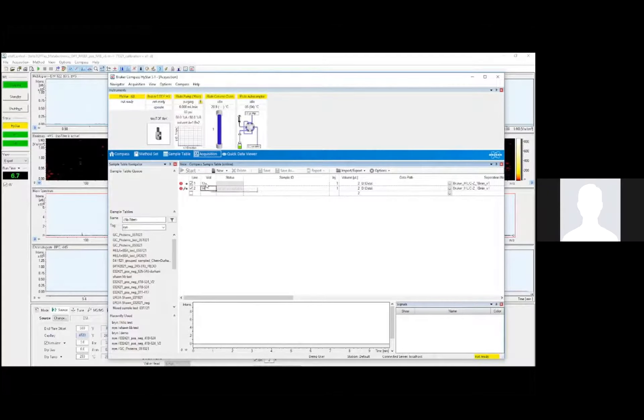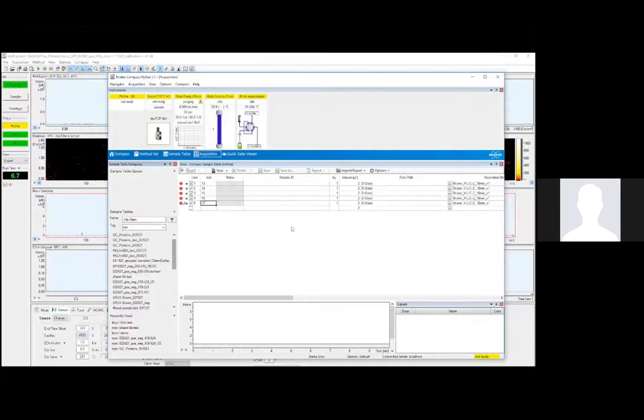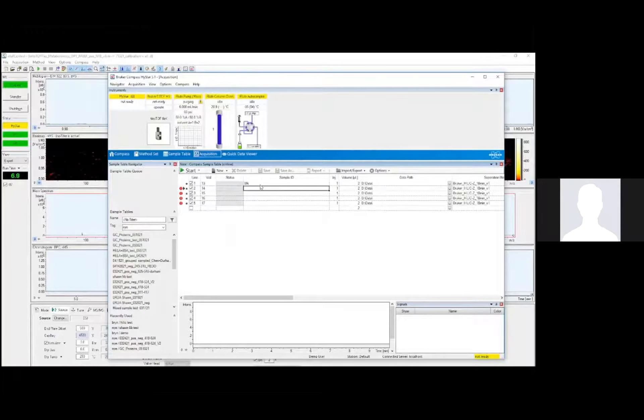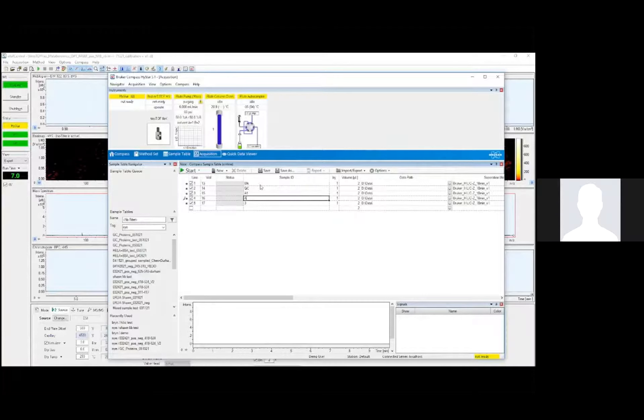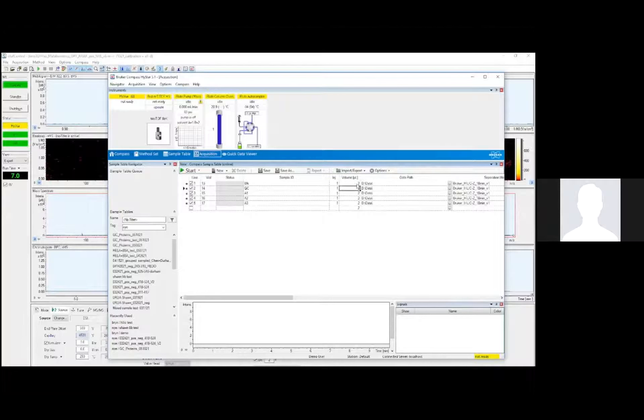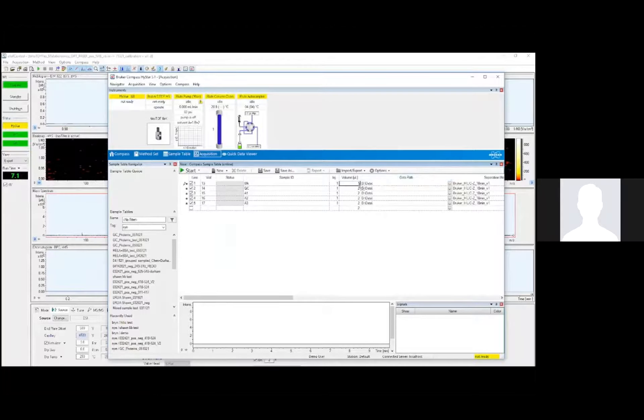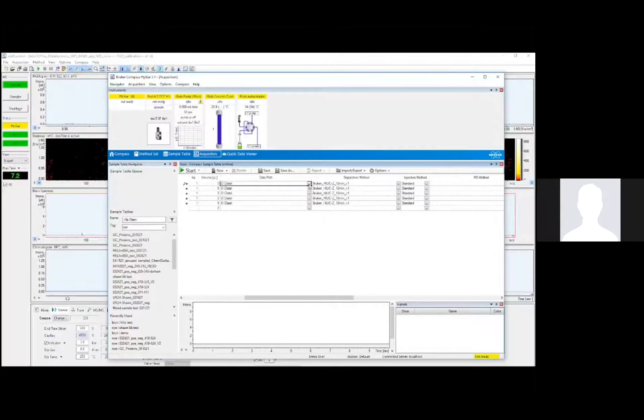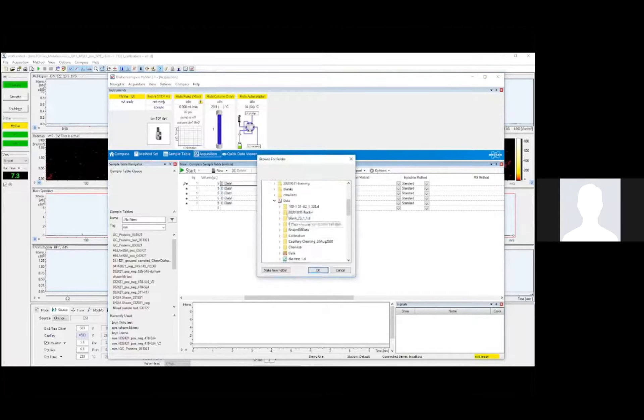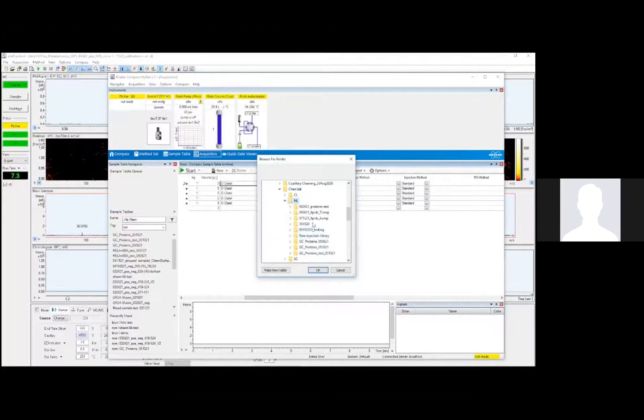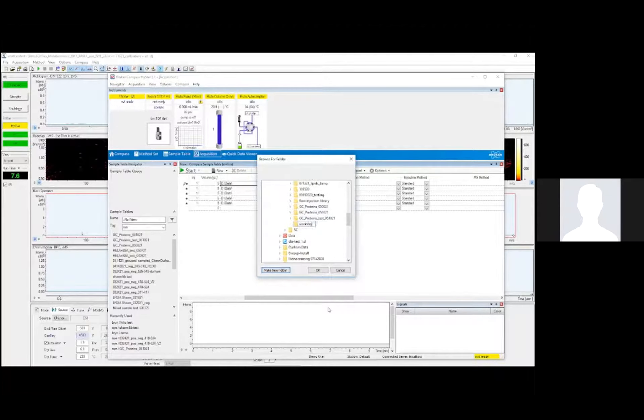Now I'll set up the sample table in HyStar. I'll enter the vial positions, and these are labels that are engraved into the auto-sampler rack and recognized by the software. I can then enter the sample ID. I'll set a volume of five microliters here. I'll set up the data path here. The data path I will set to my own folder. I'll call this workshop demo.